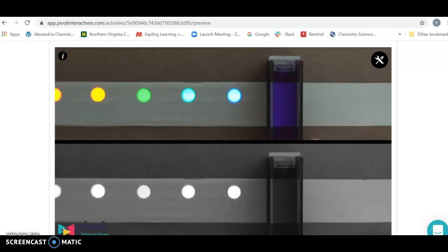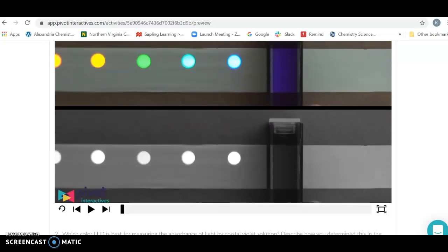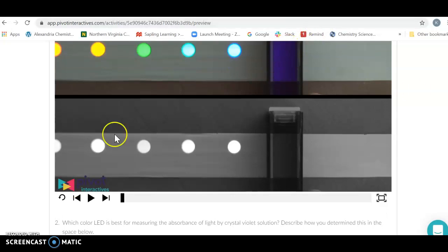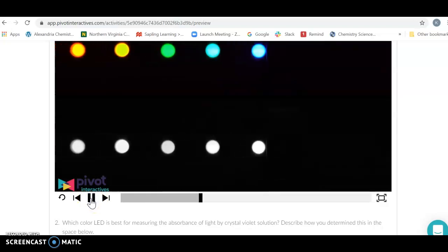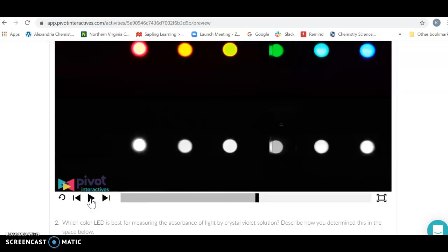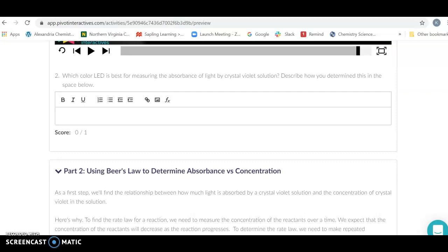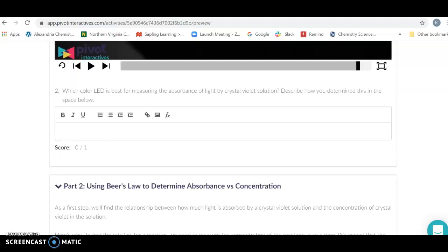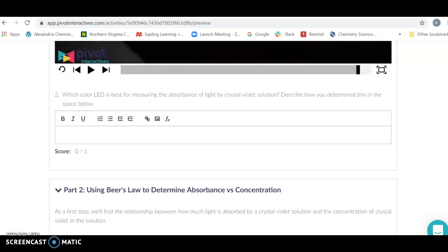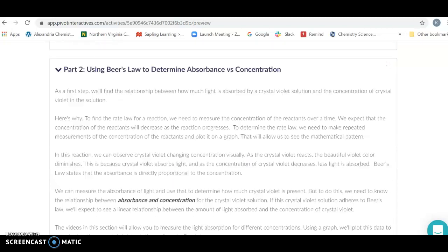Please look at the video that explains how we do this. And then we're going to consider which color of our LEDs we should use for this experiment. We're going to take our nice purple crystal violet and take a look at which color of light is absorbed by the crystal violet to figure out which color is absorbed the best. The yellow is absorbed very nicely — you could pick either one of those yellows, but they seem to use the first yellow in this experiment.